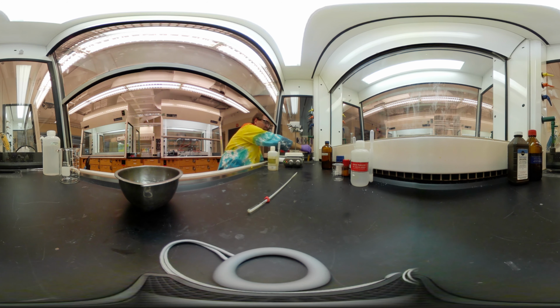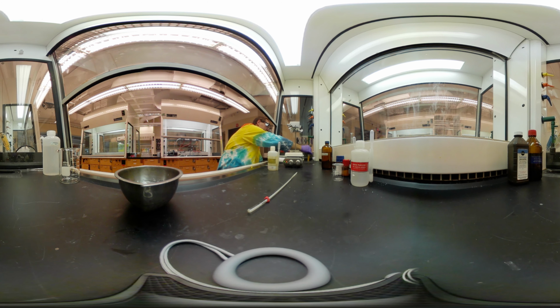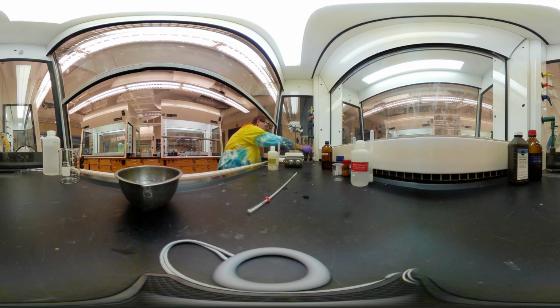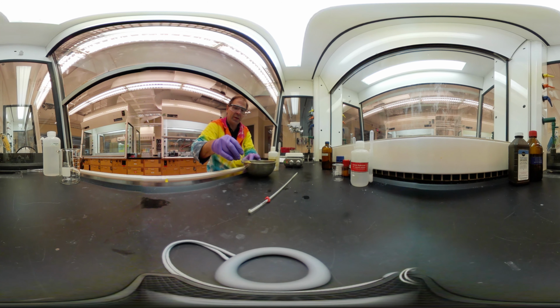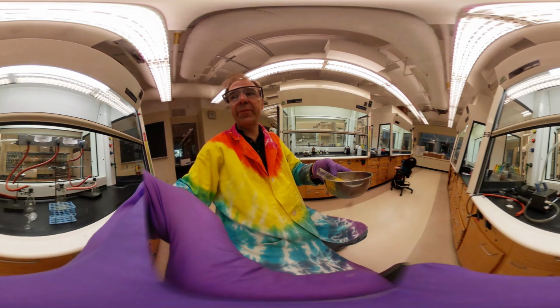As we do this, we should see the solids start to crash out. And in fact, there you go. There's our solid luminol coming out as it cools down. Have the camera in here because there's a lot of solid forming as I do that. Mostly cold, but I'm going to go ahead and set this in an ice water bath. I think we got a good amount, so let's come on over to the filter place again.